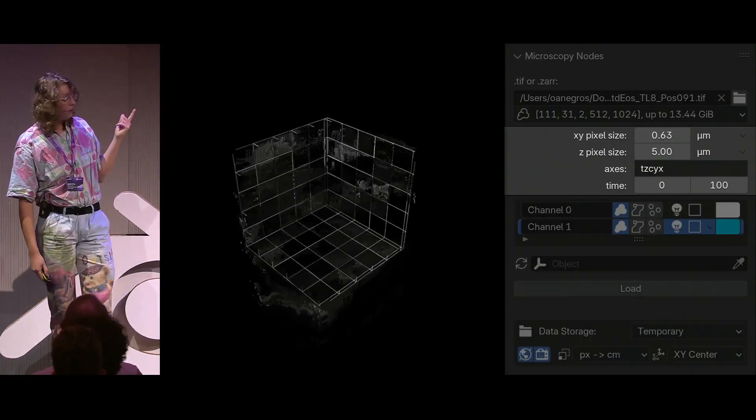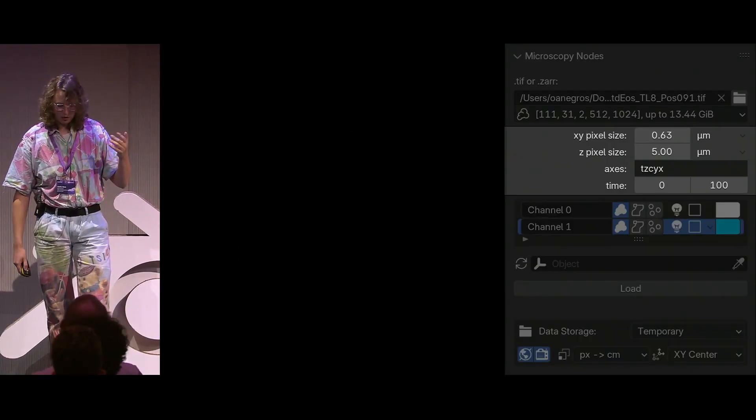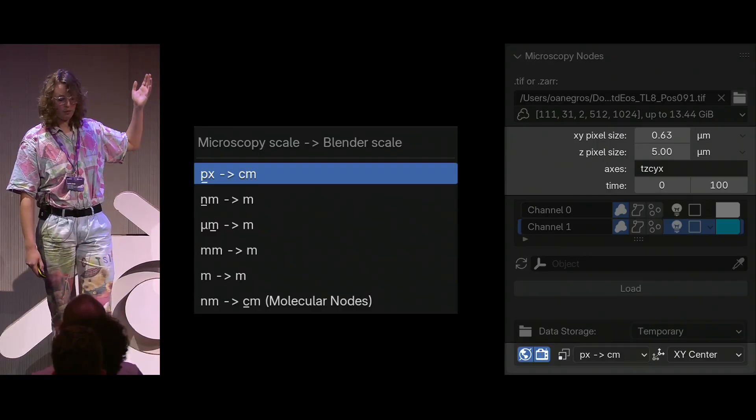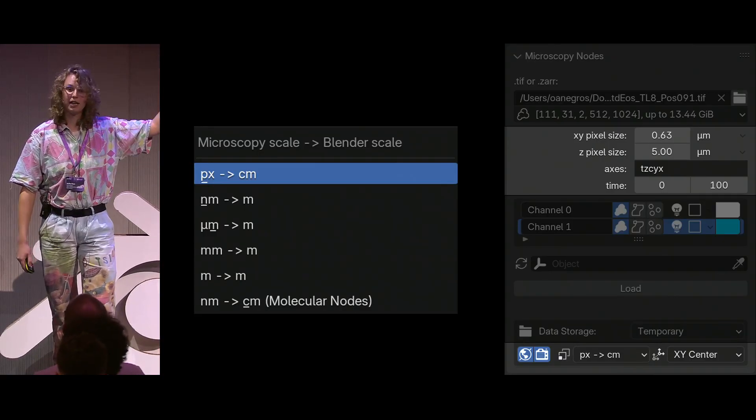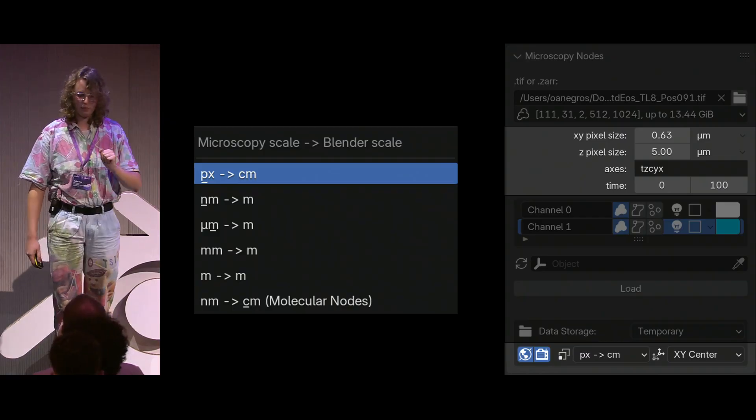But this is not the only way that you can actually get scale in there. There's also a way where you map your microscopy scales directly to your blender scales, like every micron, every blender meter is a micron, or every blender meter is a nanometer.